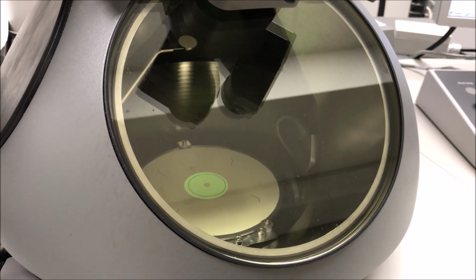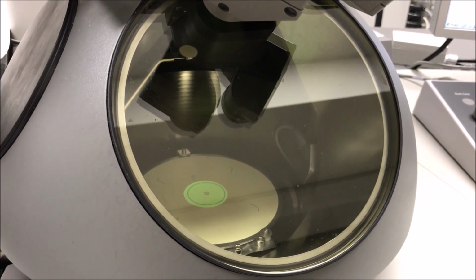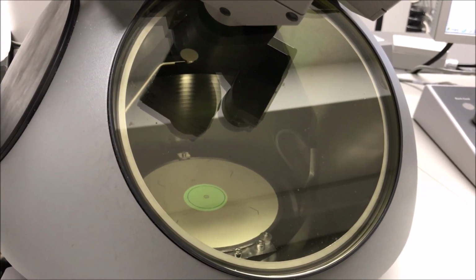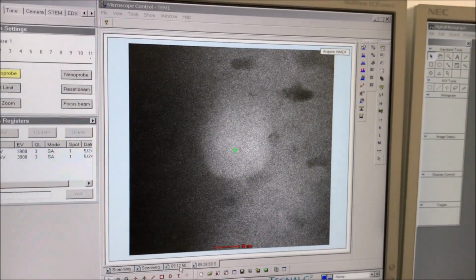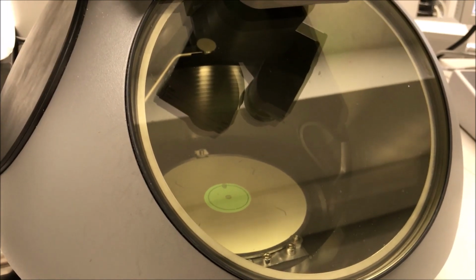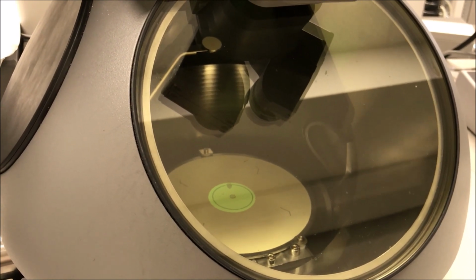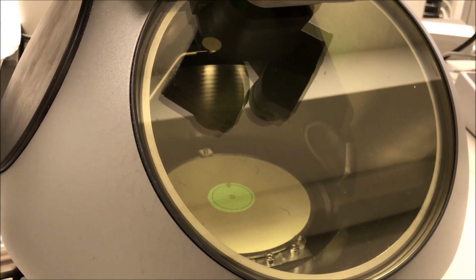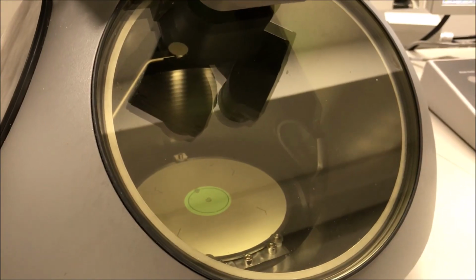So this doesn't remove contamination. But instead of all of my precursors piling up in one spot and making this giant knot of polymerized contamination, I do this, and that polymerization happens over a much larger area and a much thinner layer, as opposed to a thick layer in a small area. So this is what's known as a beam shower.